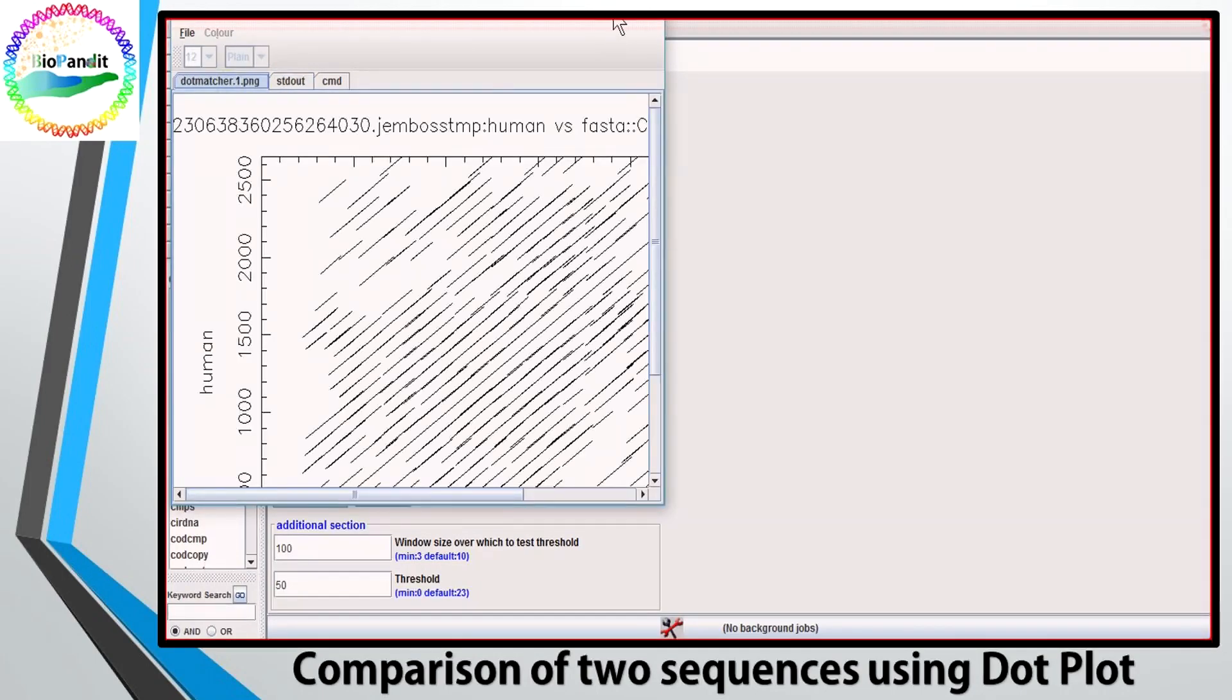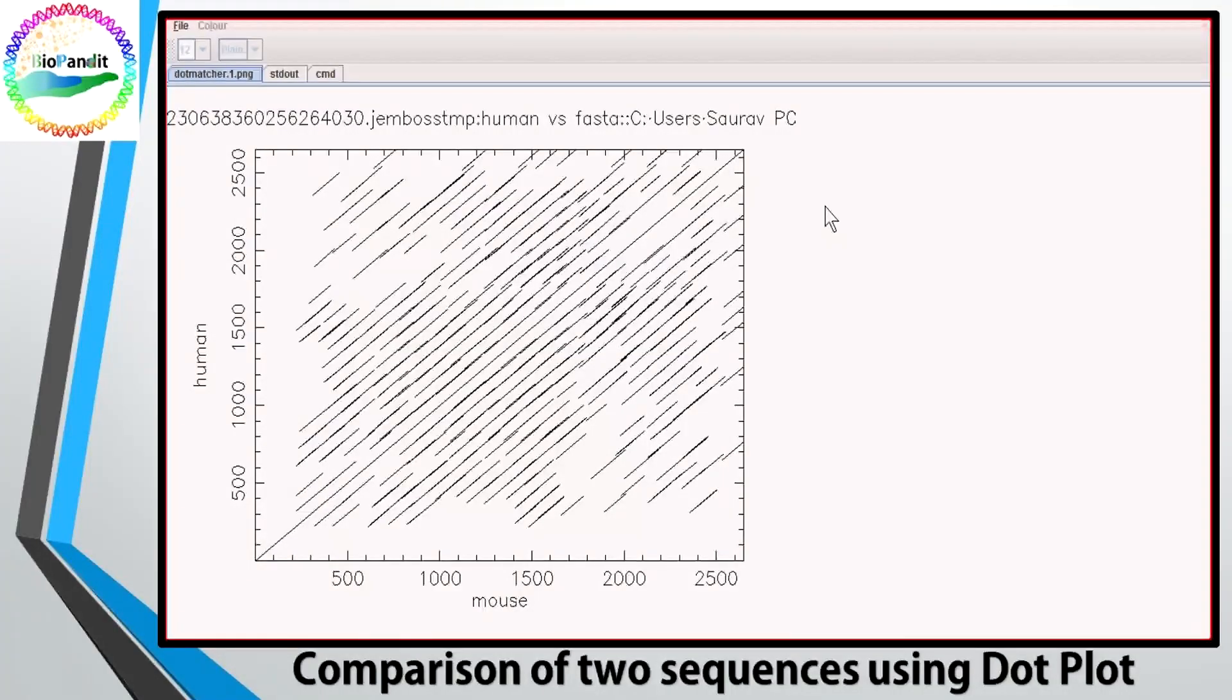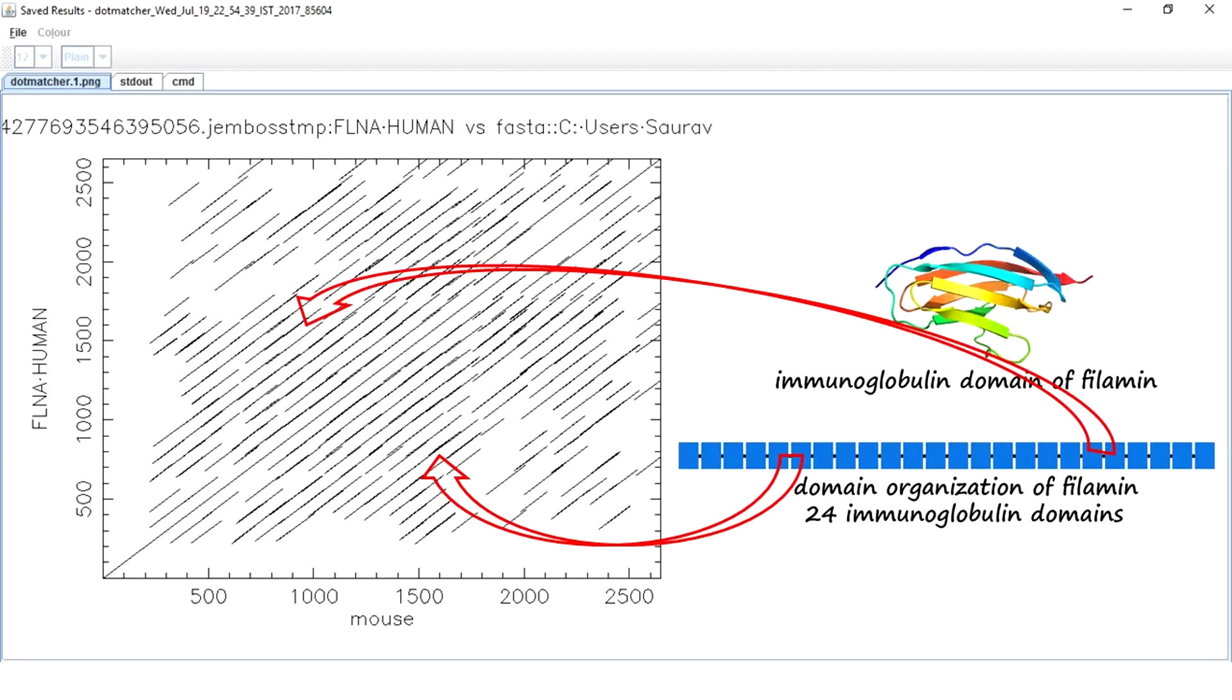A new window appears containing your plot. See, there is a continuous diagonal and several repeats. Why so many repeats? Because philamine contains 24 immunoglobulin domains of approximately 100 amino acid lengths. When we compare human and mouse philamine sequences, these domain repeats are reflected in the off-diagonal regions of the dot plot.